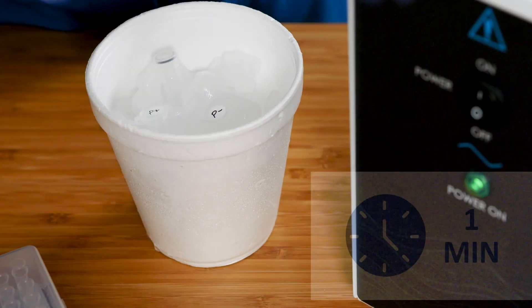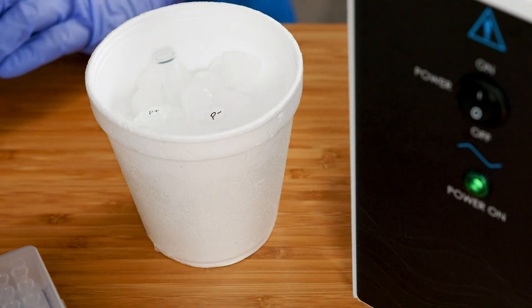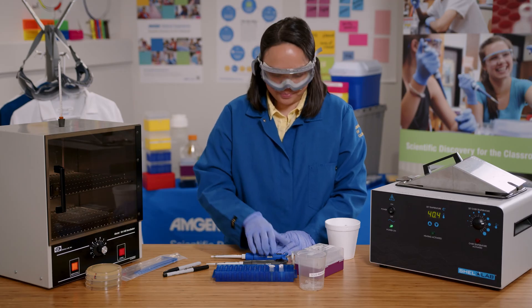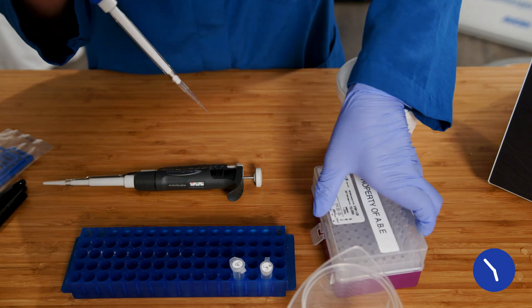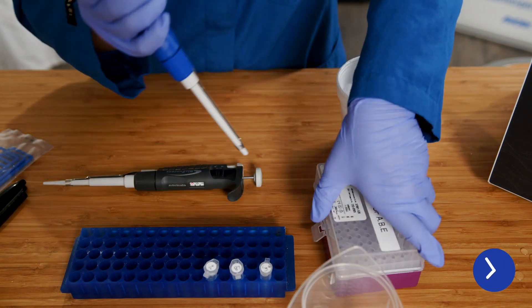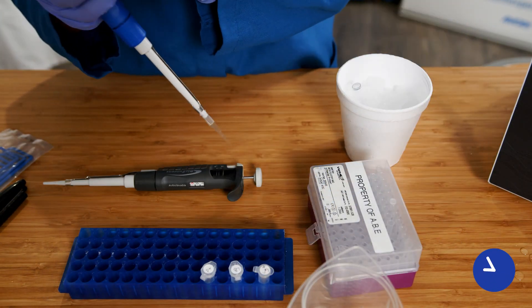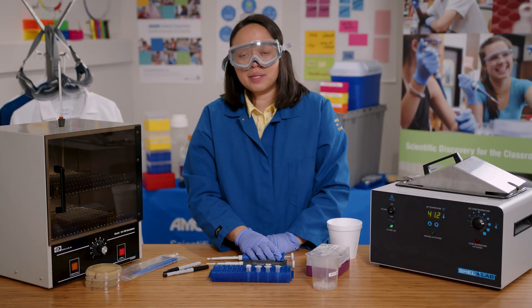Now I'll place the tubes back on ice for one minute. Now I will add 150 microliters of LB to feed the bacteria. I will give them 15 minutes to recover and start reproducing before moving them onto plates.